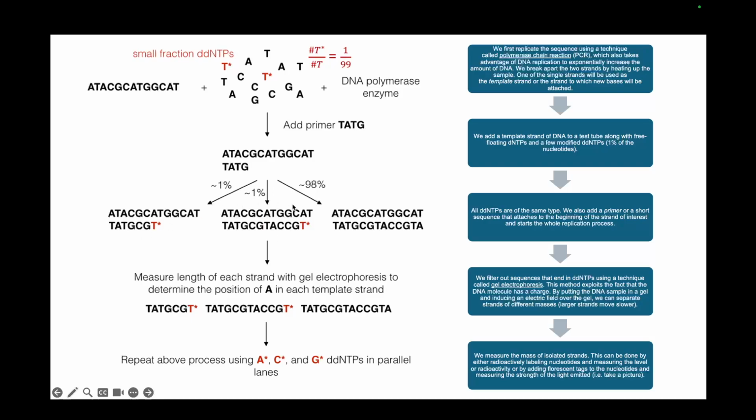These two cases are actually pretty rare, because the maximum amount of molecules that you have added are normal dNTPs. So these two syntheses have been stopped, and now you can understand that if at this position the synthesis has been stopped, since you had added ddNTP thymines, at this position there will be a complementary base to thymine, which is A. So wherever the synthesis stops, you can have an idea what is the complementary base for that particular DNA strand.